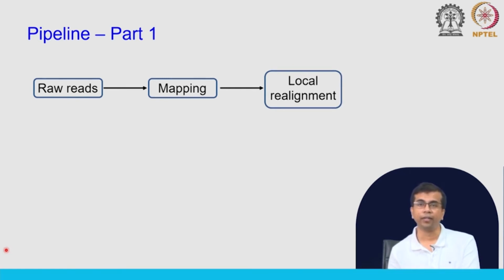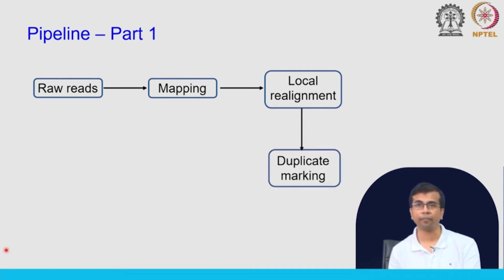This is again very important, as we have just discussed: because of certain regions where you have indels present, or regions that are low complexity regions, unless you do local realignment using other tools, you will have false variant calls, and we want to minimize that. So, we will do something called local realignment. You will see in the hands on that we will actually do the realignment.